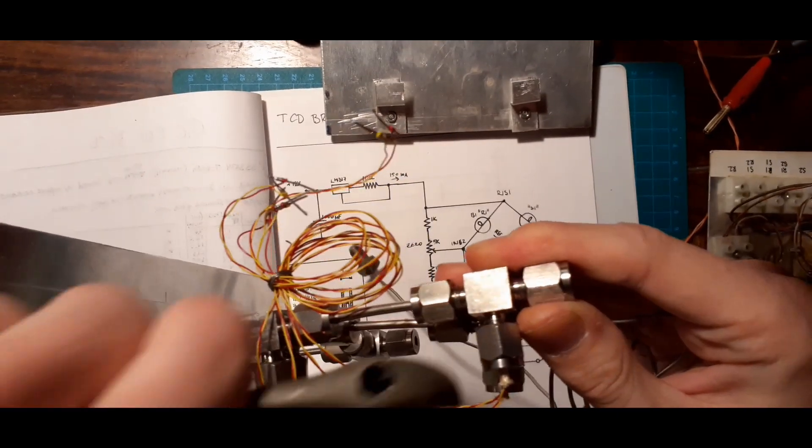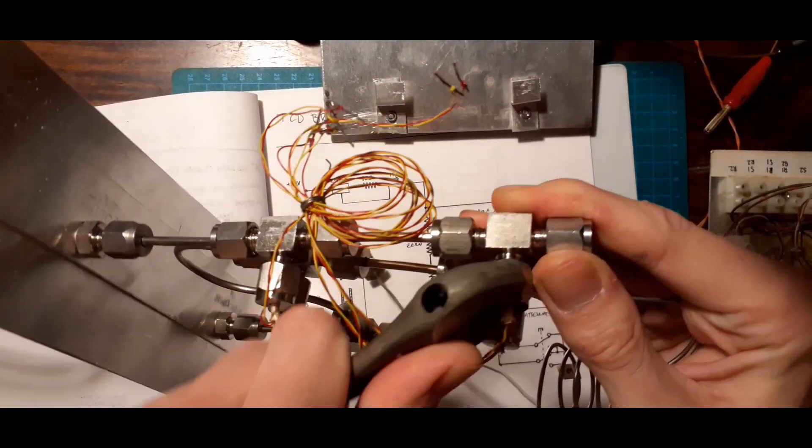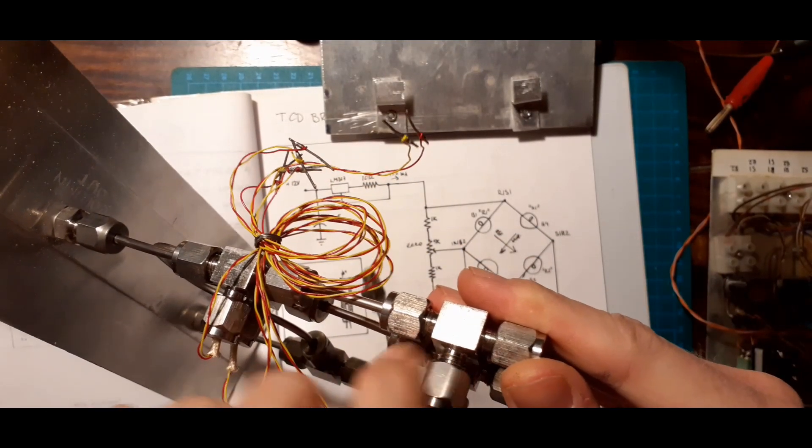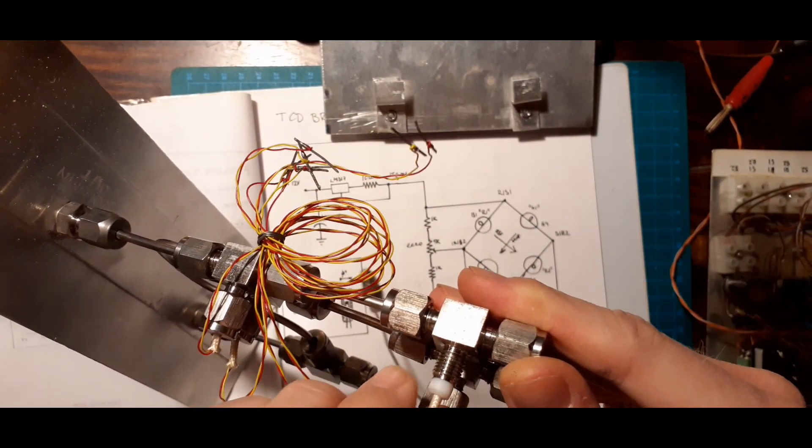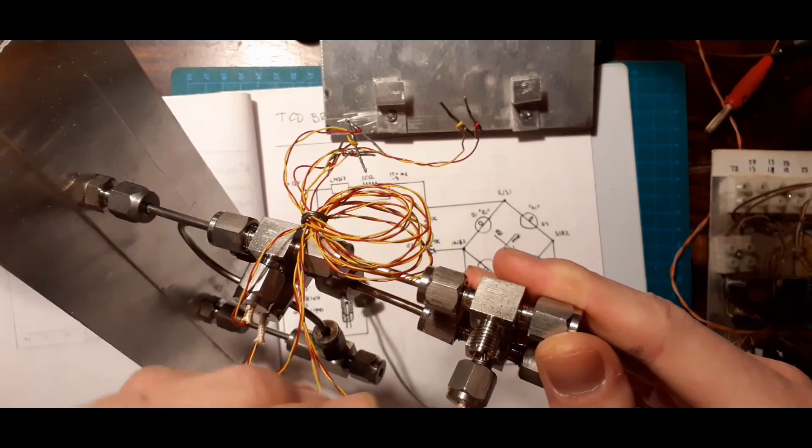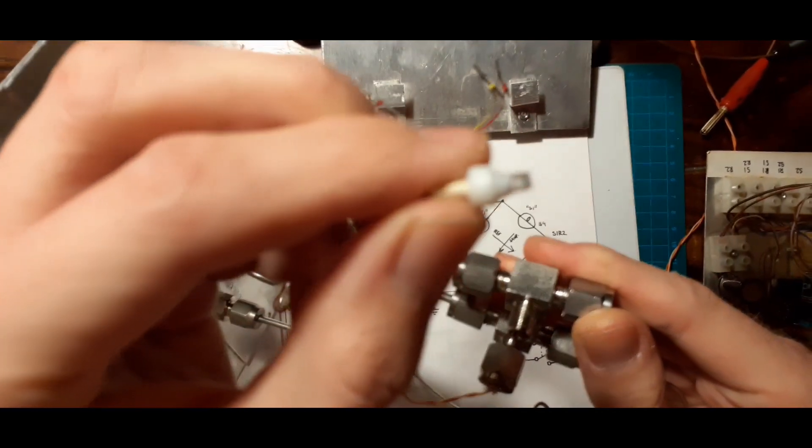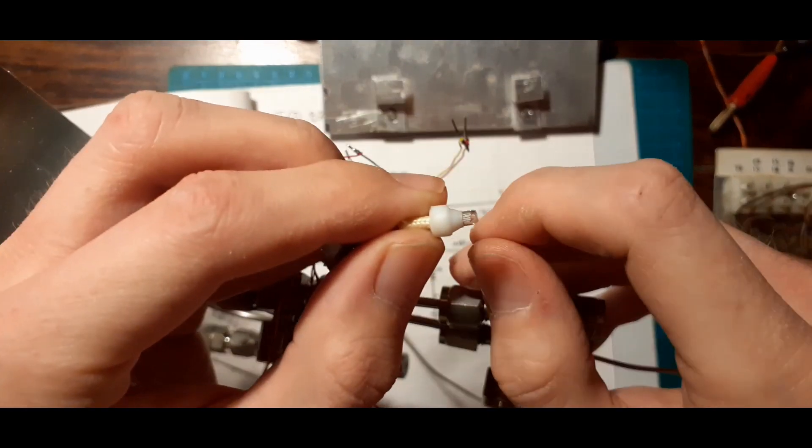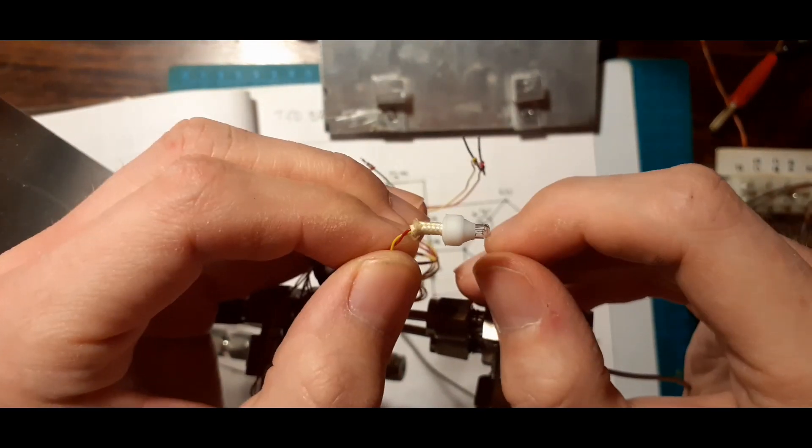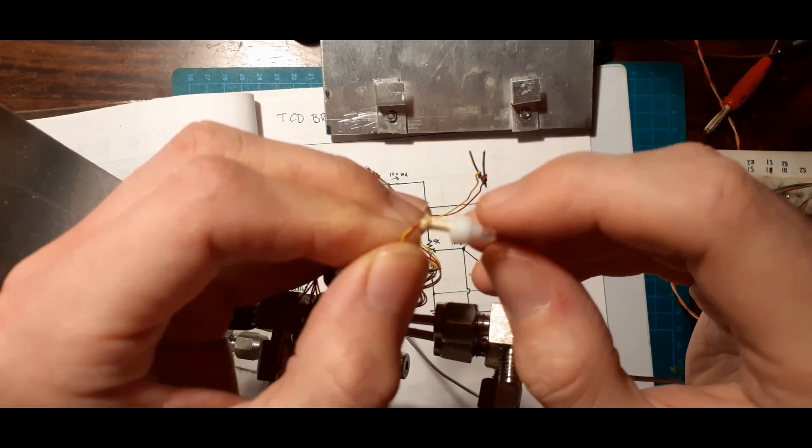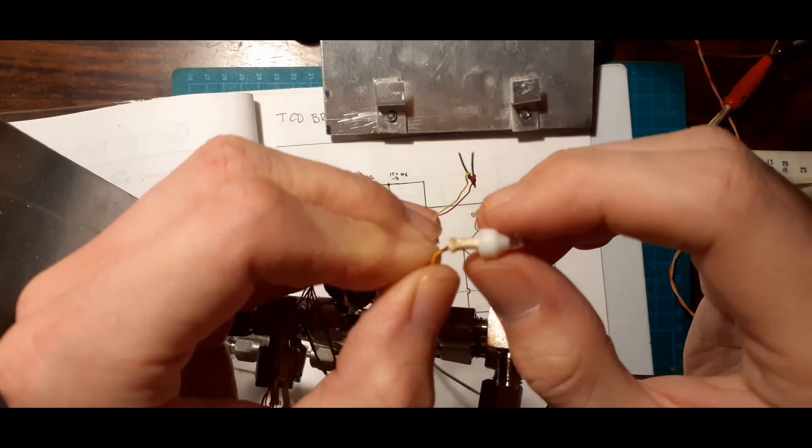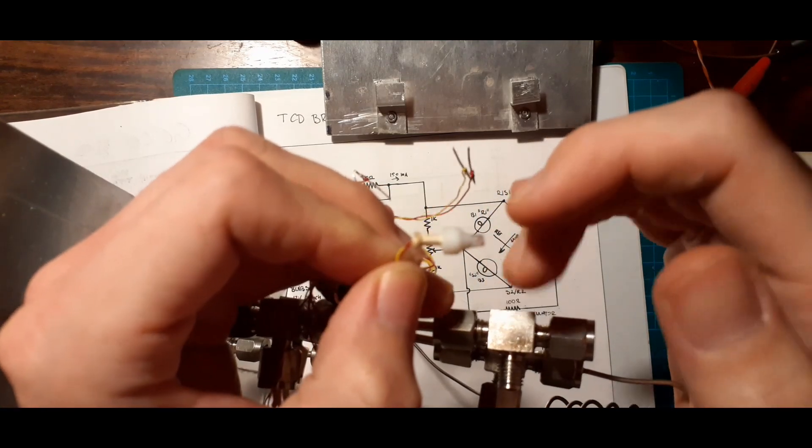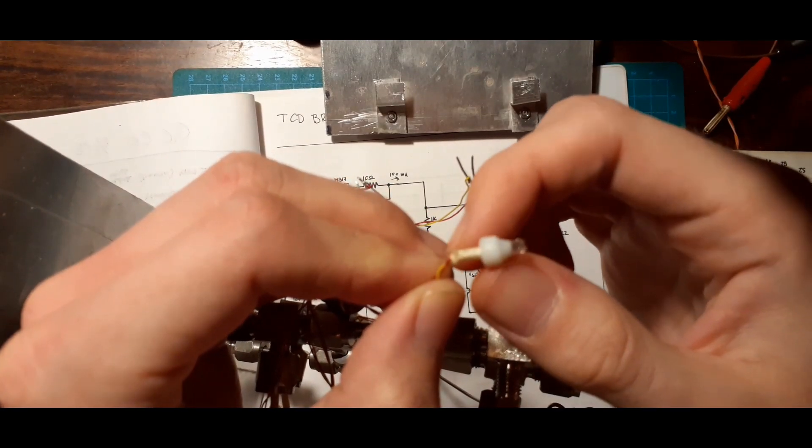And in the third, the side port here, under these nuts, you will see this is the thermal conductivity element. If we can focus on that, that would be nice. Yeah. What it is, is literally just a tiny light bulb. I was able to source some 1/8 inch light bulbs, which fits these fittings exactly. This is a teflon ferrule.